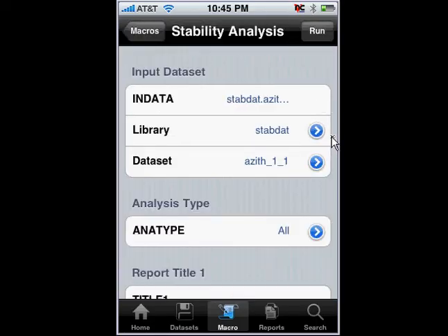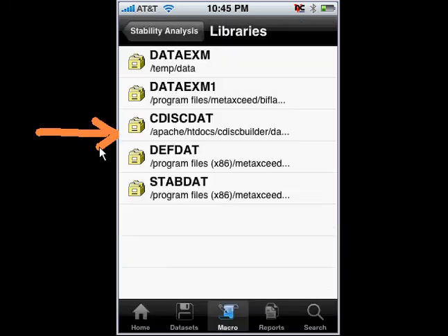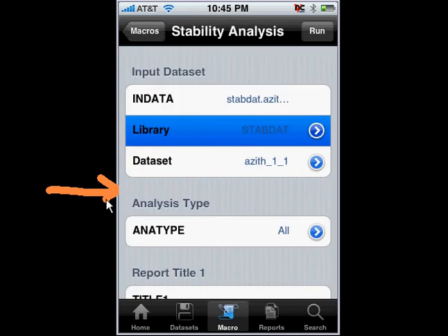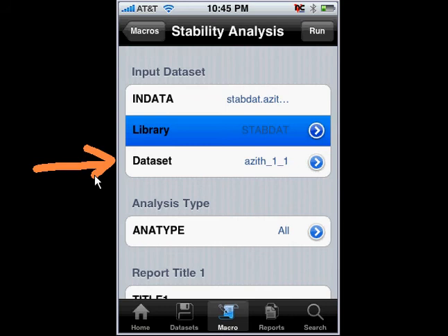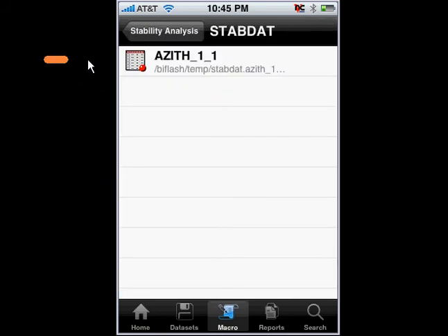The way we did it was: you first select on the library, which determines where on the server the SAS input data set is located — that contains the raw data you're going to analyze. So I'm going to select this stability data here. If you were to load many data sets, you can perform different analyses on different data. I just have one example here, which I'll go ahead and select.